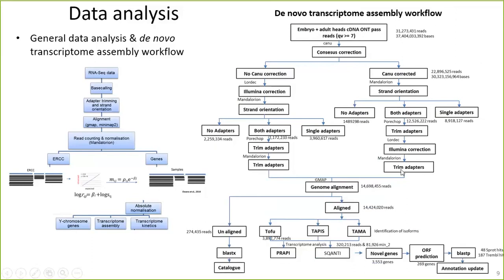I'll not go through these other steps, but basically we use one of these tools mainly to perform a de novo transcriptome assembly, and then we analyze the assembly using SQANTI, and then we catalog basically what we see. So I'll then go to give you some of the results that we have.